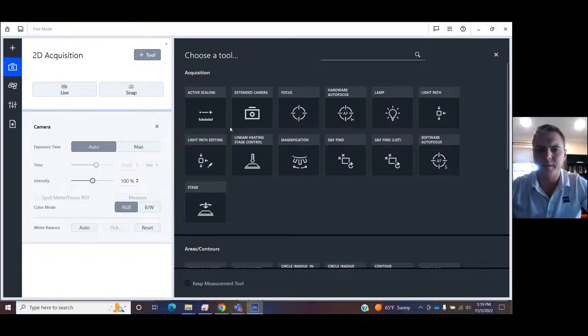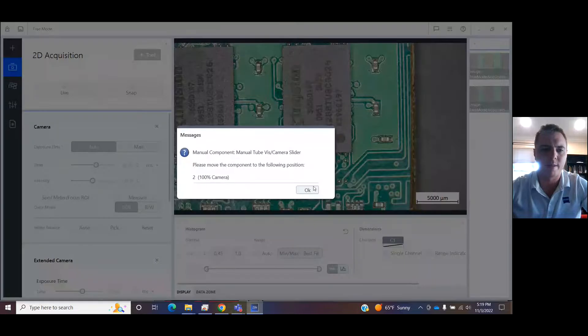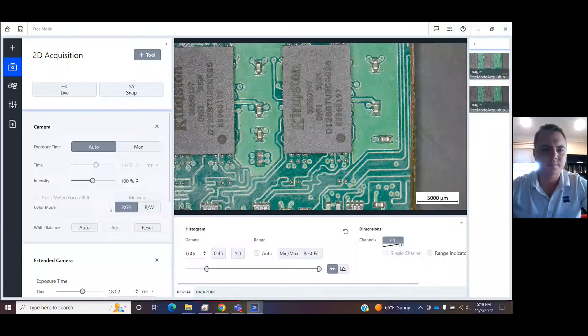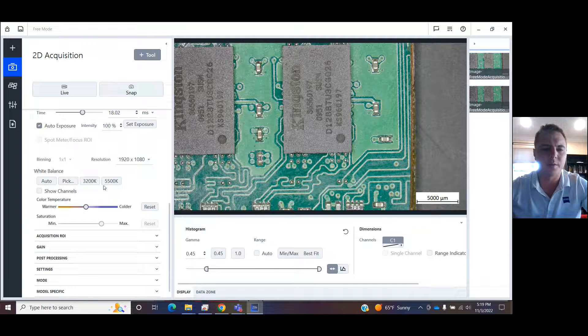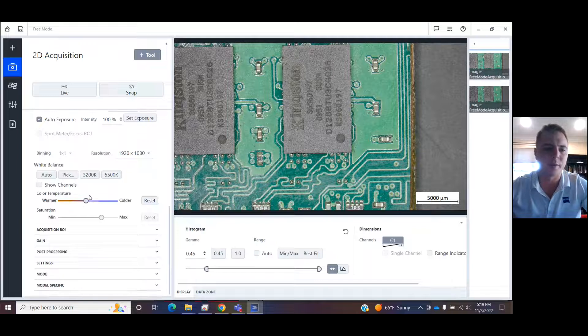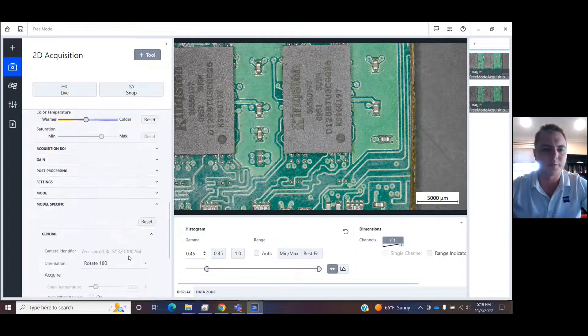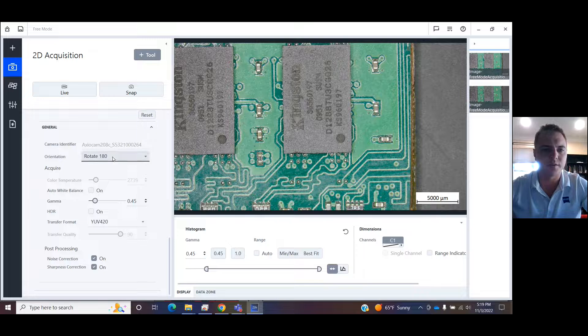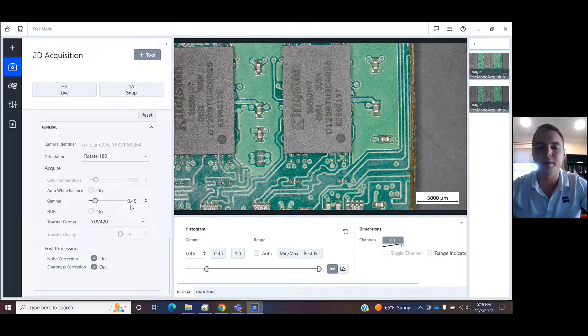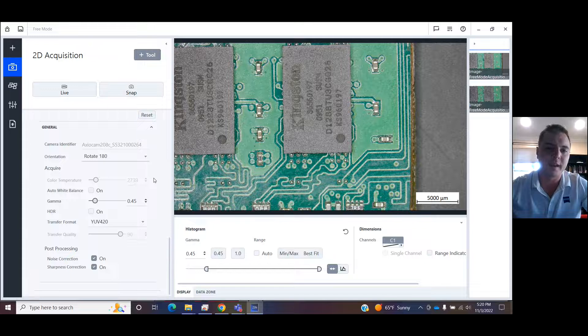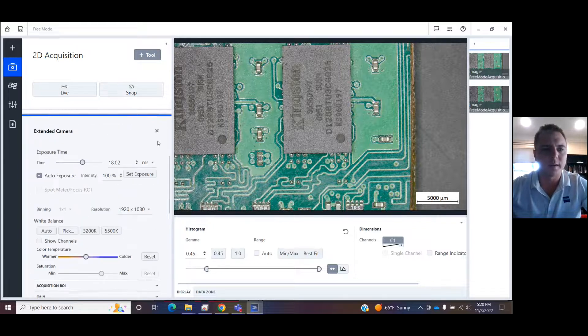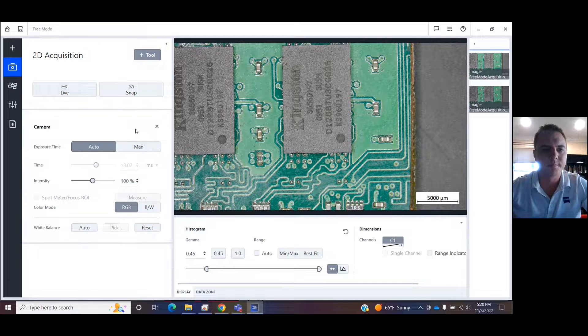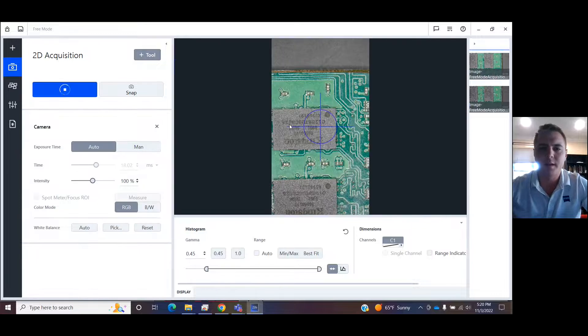You can go into tool and we can turn on extended camera if you want to get more detailed. With extended camera, you can do things like pick an automatic temperature for the white balance. Under model specific, you can change the rotation of the camera so that it's real time and you know when you move left, the camera moves left and right and so on. There's a lot more here you can get into. Back to live.